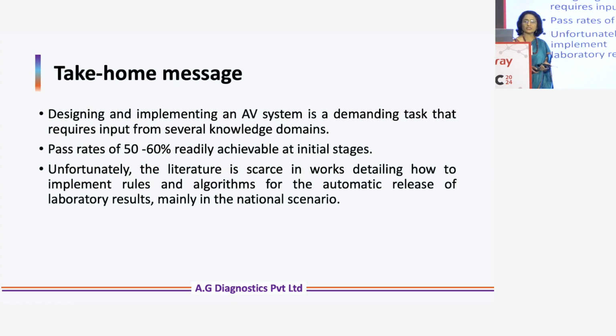So take home message is, designing and implementing an AV system is a demanding task that requires input from several knowledge domains. Pass rates of 50 to 60% are readily achievable at the initial stages. Unfortunately, the literature is scarce in works detailing how to implement rules and algorithms for the automatic release of laboratory results, mainly in the national scenario.